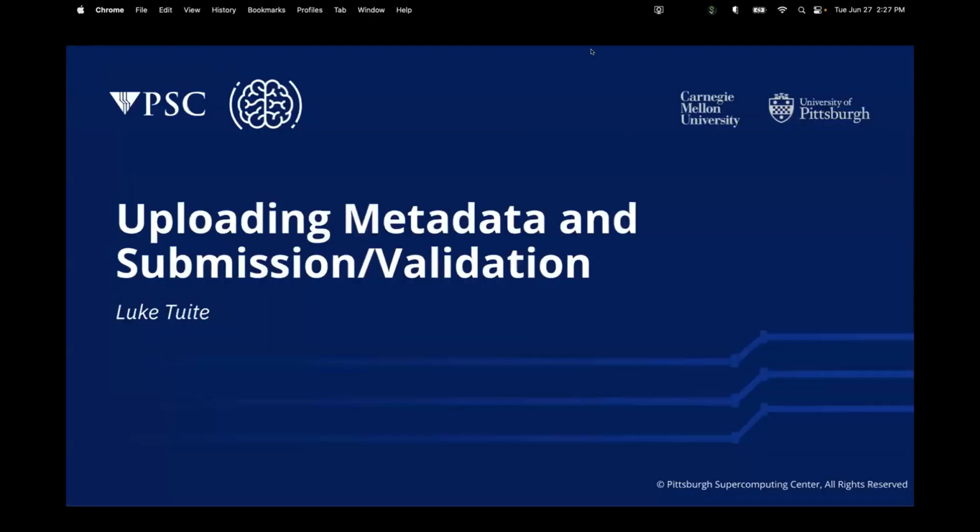With that, I will hand it over to Luke, who's going to show you how to actually upload this file. Hey. Sorry, just getting my things together here. Okay, there we go.